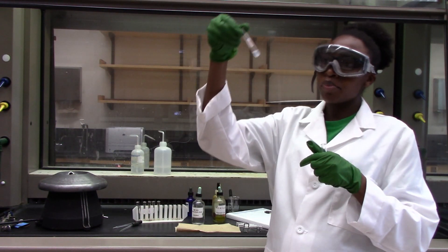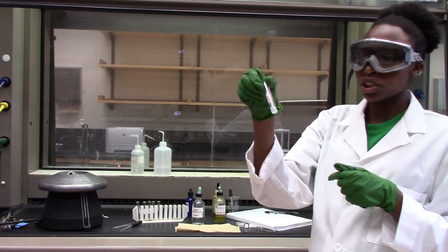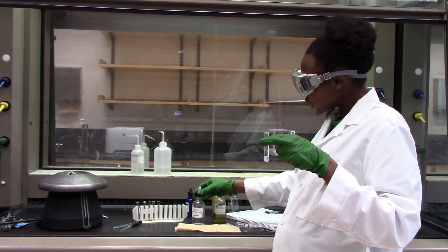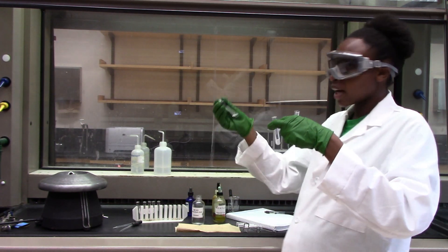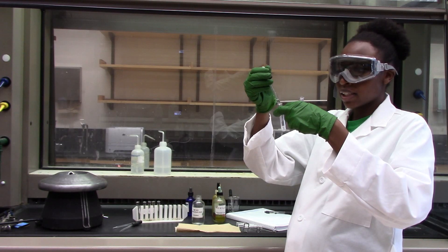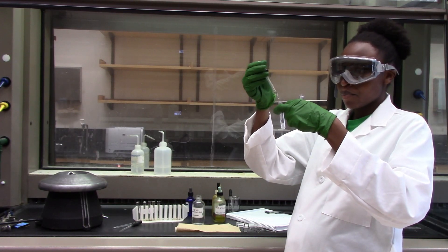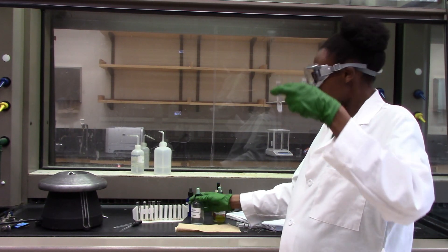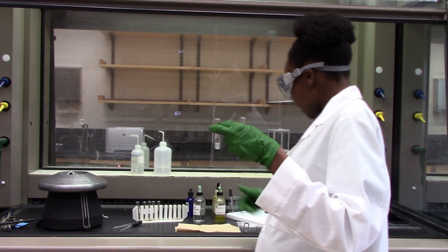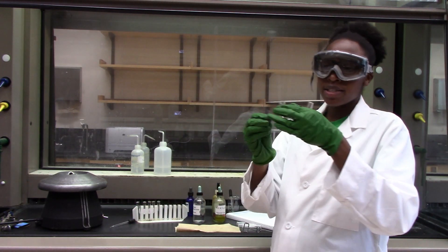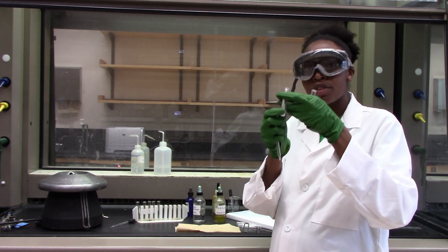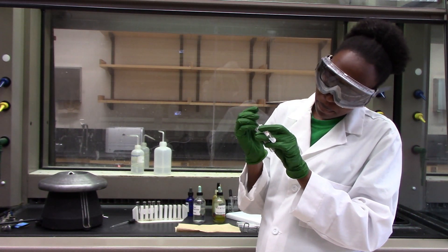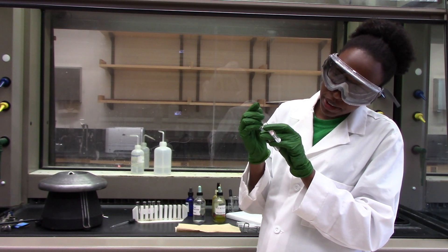At this point I have all my precipitate at the bottom and I am going to add one more drop of HCL just to make sure that none of the silver group cations are still in my supernatant. As you can see, it's clear and with this I am going to carefully take out the supernatant and leave my precipitate in the test tube.